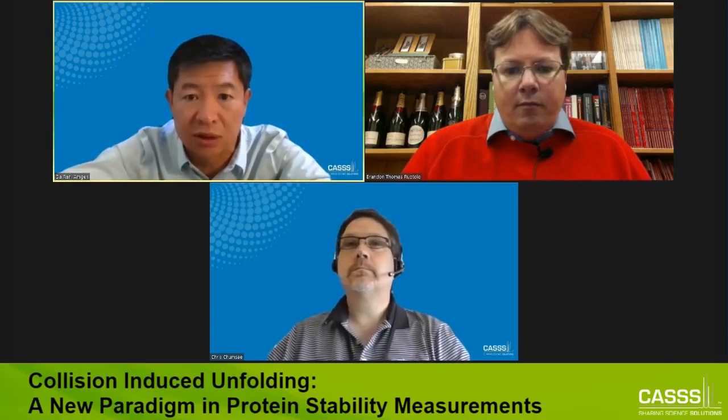Thank you. All right, next question. Can you relate CIU transitions to the stability of the secondary structure in proteins?